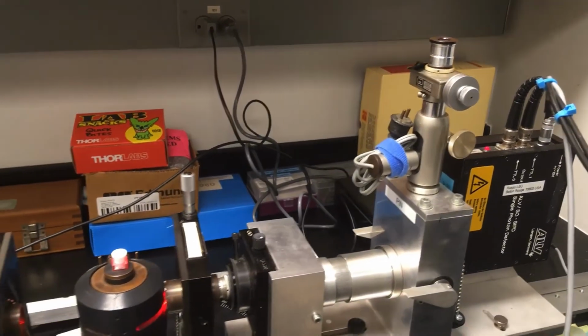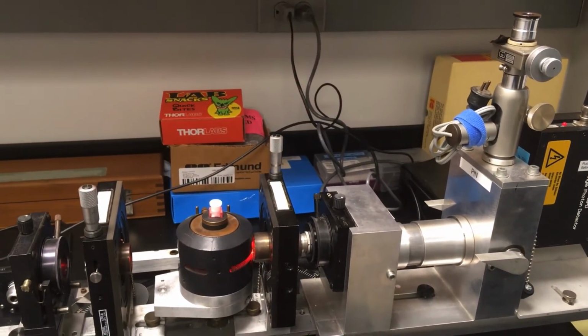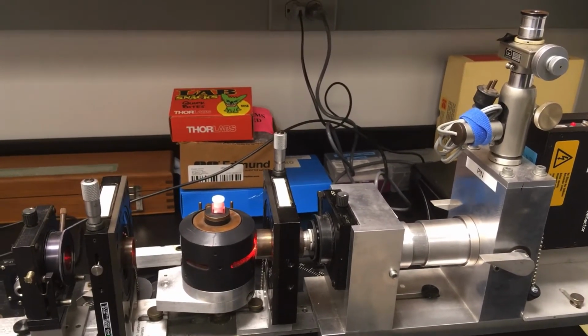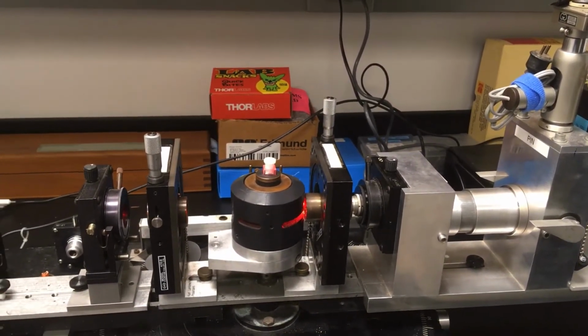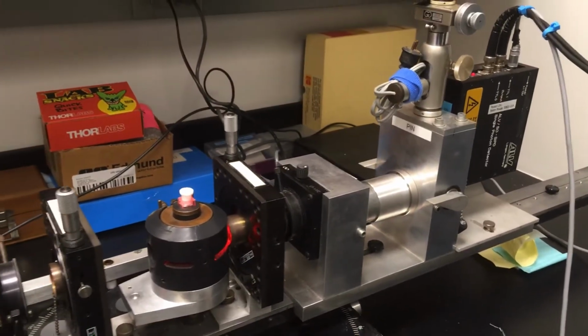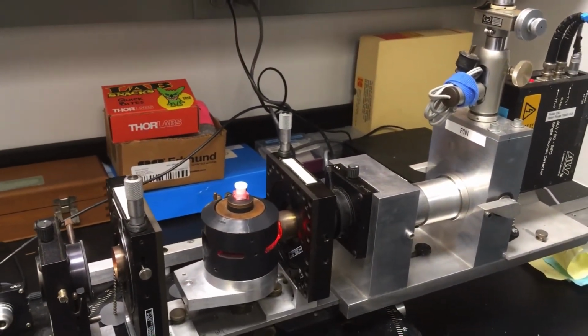The amount of birefringent light generated by the fluorimeter cuvette is fairly small, although it's much greater than the scattered light. And the two polarizers are in complete extinction. It's a very good extinction between those two polarizers. So if I was to remove the sample and look in there, I would see basically nothing.